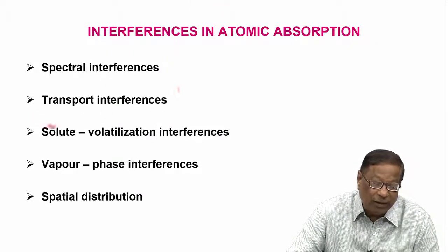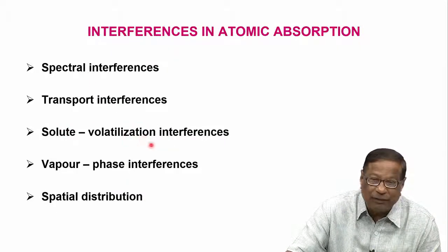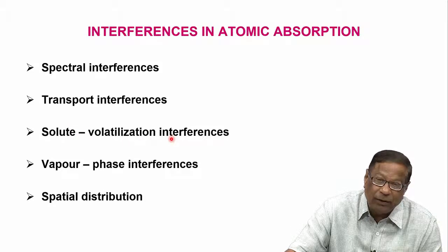Then there are solute volatilization interferences. The solute itself, the metal salt, may volatilize and go off.